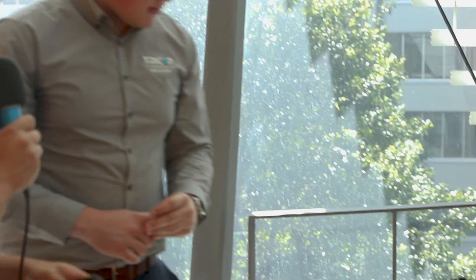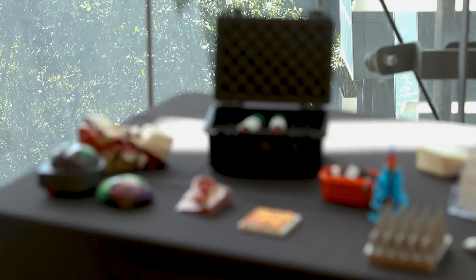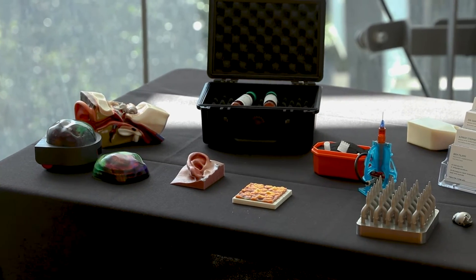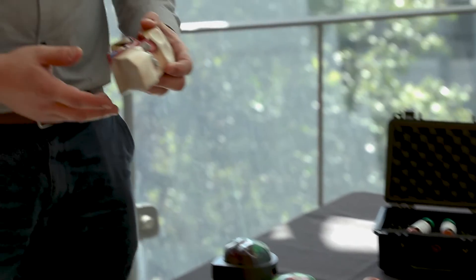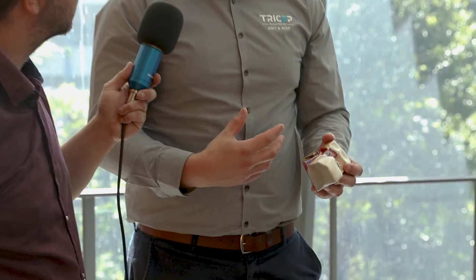You've got some cool toys here — can we have a look and run through what exactly they are? Yeah, so we have a range of different 3D printers. One example is a full-colour 3D printer that allows us to easily translate ideas between clinicians and engineers and chemists like ourselves, because trying to translate an engineering-based idea to a clinician is hard, and vice versa.